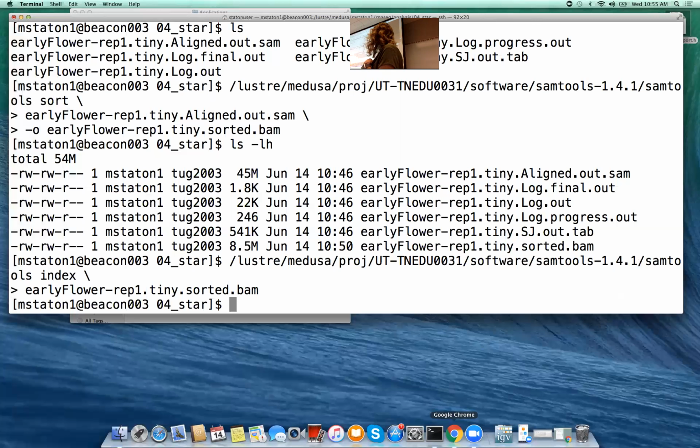So let me back out and see if we can see. Okay, if I back out too far, we can't see the alignments anymore. But let's look at a single gene maybe, like right here. So that is a bad example. That gene might not be annotated very well. Let's look at this gene. If you drag and drop here, it'll move the whole window, whereas if you drag and drop up here, it'll zoom in. So let me try to get this gene here.